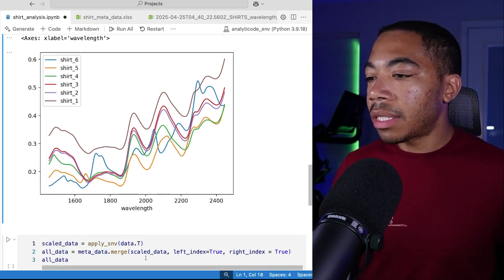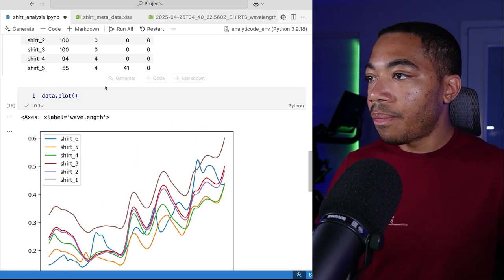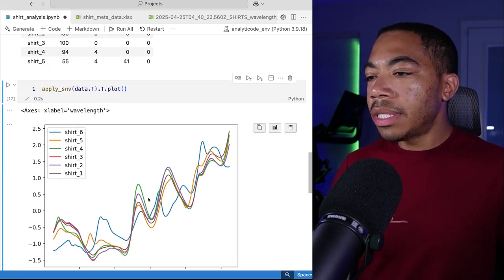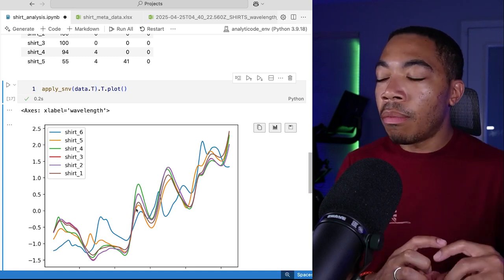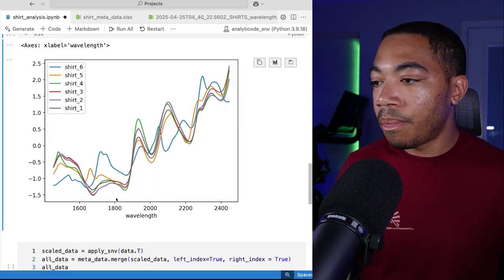And so let's process this data, and let me show you what that looks like again. So I'm going to take just this line here and modify it. And let's transpose this one more time. And we can see how by adjusting for the scatter, our data is now much cleaner. It looks significantly better. And this will help the clustering that we will perform later.